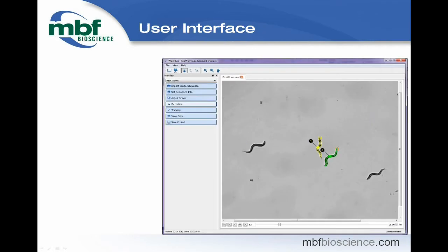I'm going to go over the user interface on this slide first before we jump into the demonstration, just so that you know what I'm doing as I move around the screen. This first element here is a drop-down for the workflow category. You'll see that right here in the red box.